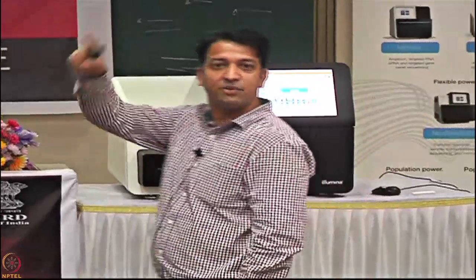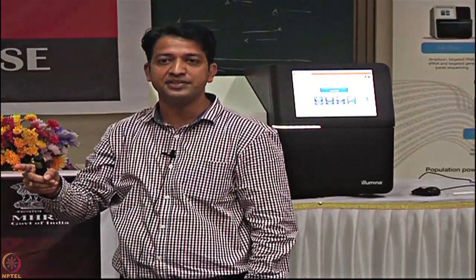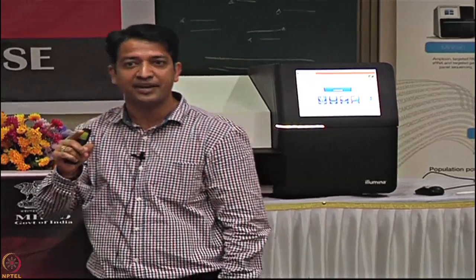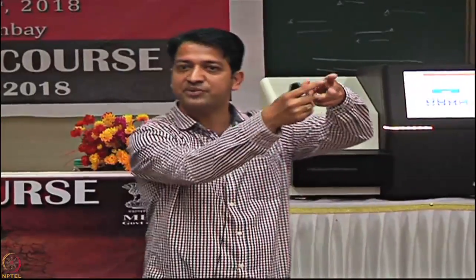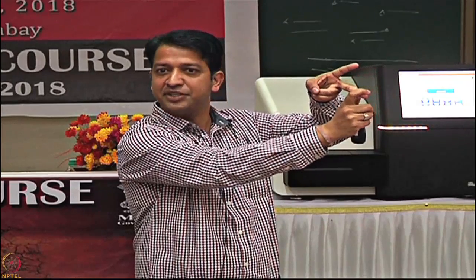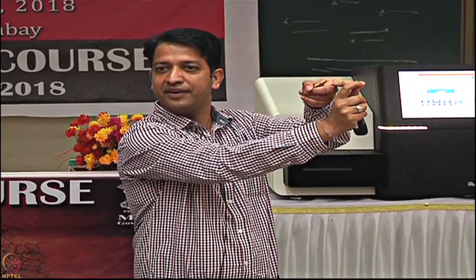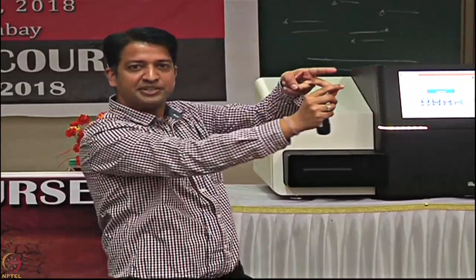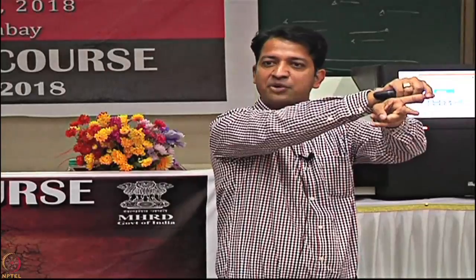So what exactly is paired end sequencing? Essentially, as ma'am said, initially we generate both fragments. If you wish to sequence only the forward strand, you cleave away the reverse strand and sequence only the forward strand. In paired end sequencing, you regenerate both strands. The second time, you retain the reverse strand and cleave away the forward strand. In this manner, you can sequence both strands of a stretch of DNA, one forward, one reverse. Initially we cleave away the reverse fragment and sequence the forward. During paired end, we regenerate, we deblock it. Remember? So both strands will be generated.